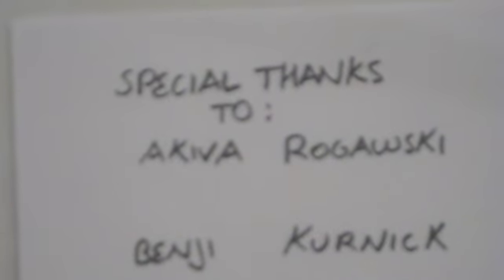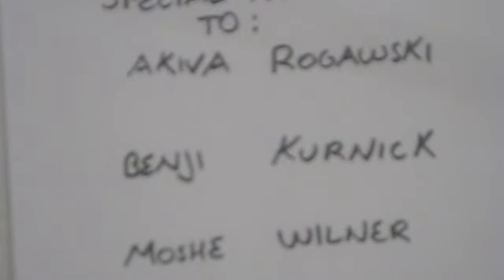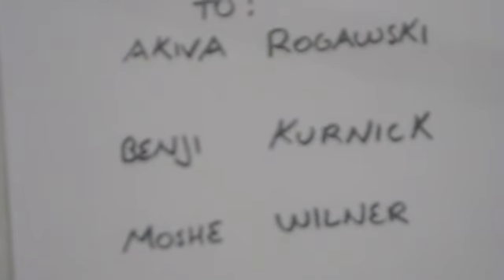So what we have just done is used a solution of known molarity to calculate the molarity of an unknown solution using phenolphthalein as an indicator to indicate whether or not it is acidic.